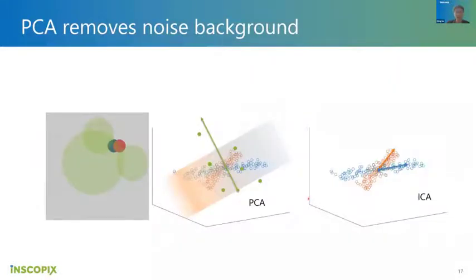The PCA component is a little bit different from the ICA. PCA is more related to noise reduction. For example, if I have 2 cells with noise surrounding them, and you plot their luminance, PCA is trying to distribute them into different dimensions, and in this simplified case of 3 dimensions, the noise can be thrown out since it occupies the 3rd dimension, Z. After throwing out the 3rd dimension, we preserve most of the signal, in 2D in this case.